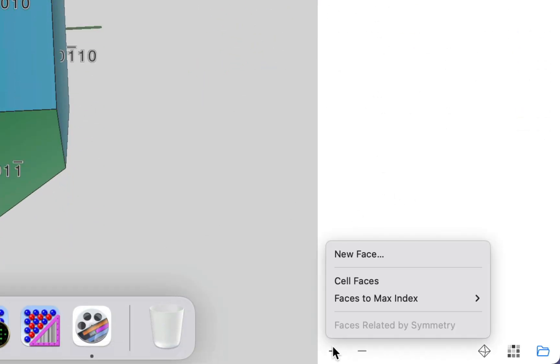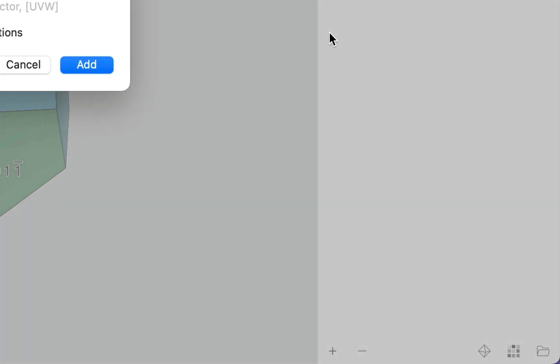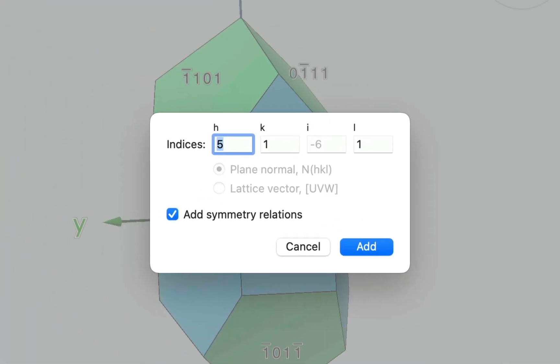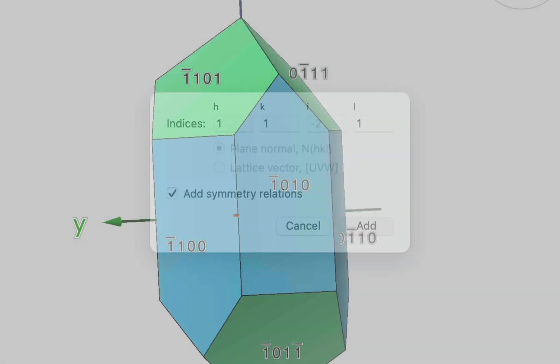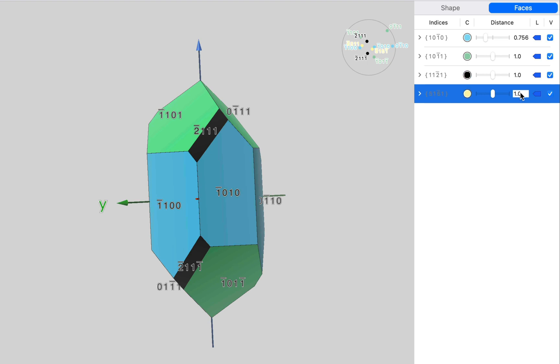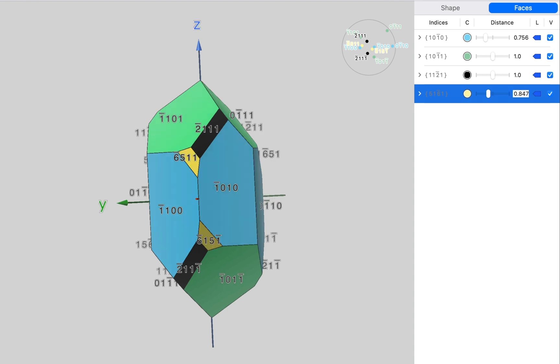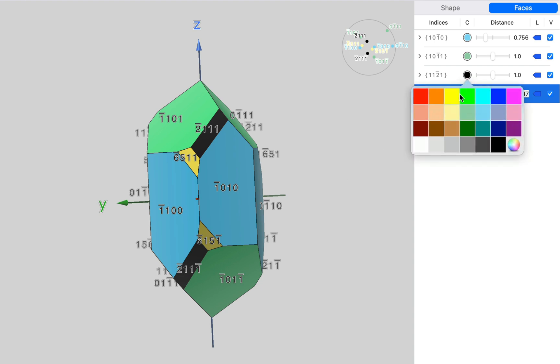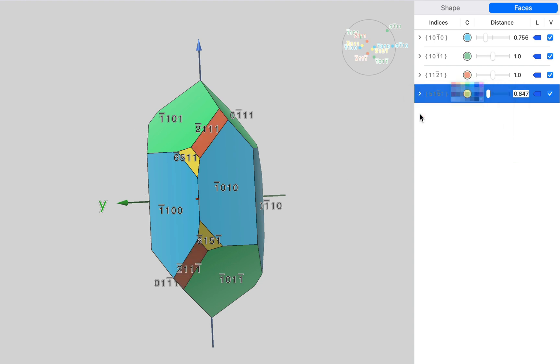Now, we're going to choose another face. And this face is going to be parallel to 1, 1, bar 2, 1. Now, we need to set some sizes. I'm going to choose 1 for that one. And I'm going to choose 0.847. And now we've got our faces visible. Let's choose a pink color for the 1, 1, 1 face.